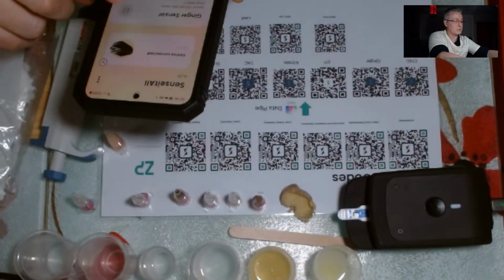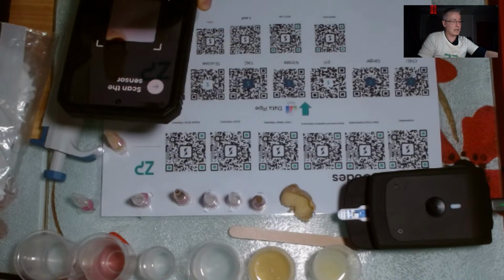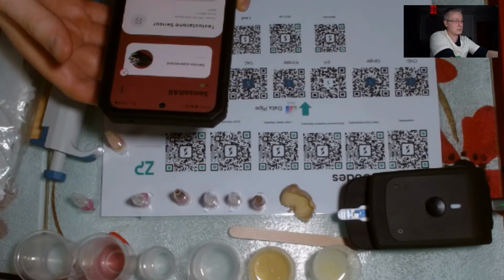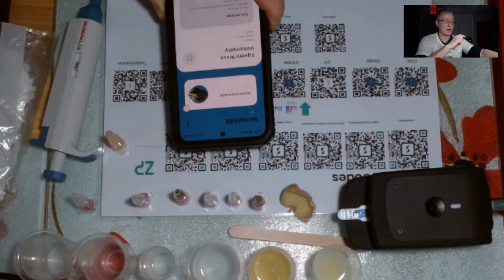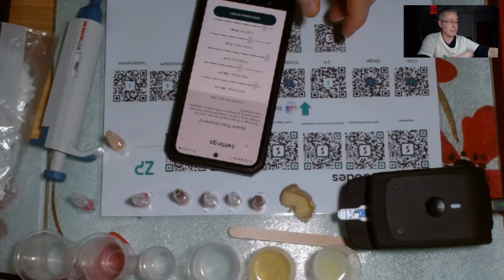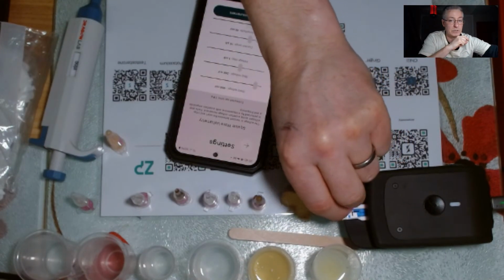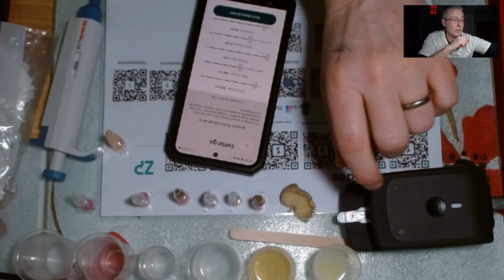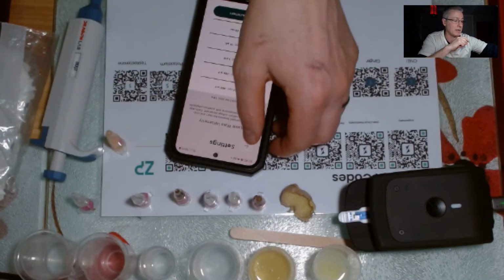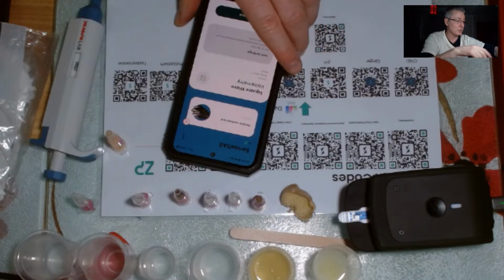I don't want to say a bias, there's an unconscious bias in anything. I just want to scan the, that's testosterone, sorry. I want to scan, so I put this now into square wave voltammetry. So now I can in fact do square wave voltammetry on this device, using this electrode. I've got a very strong suspicion that this electrode, this device, this square wave voltammetry will run that assay absolutely no problems. I know they're using differential pulse, but square wave is probably pretty equivalent.